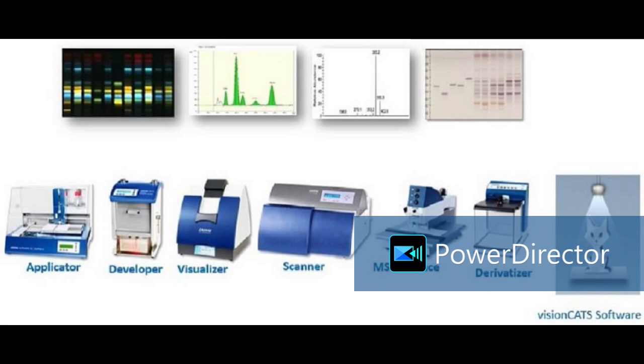Okay, that means plate selection. Generally 90% of the time we are using TLC, HPTLC plates for separation. But sometimes we have to use different plates like RP plates, reverse phase plates. HPTLC is based on the adsorption principle and normal phase generally, but we can do reverse phase HPTLC also. RP plates are also available. For some samples like oil, Sudan dyes and all, RP plates are very important to use.